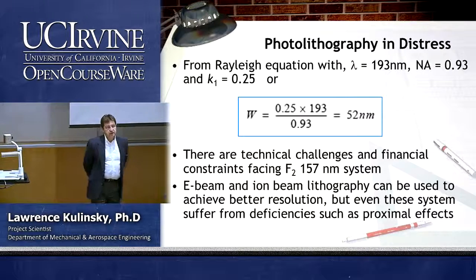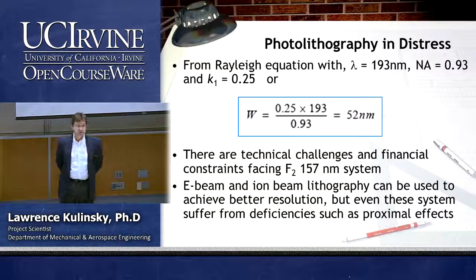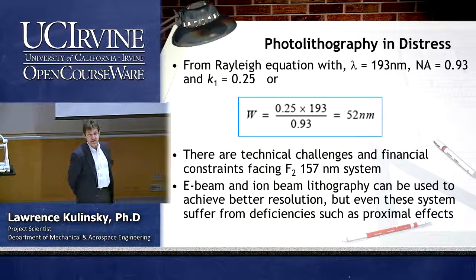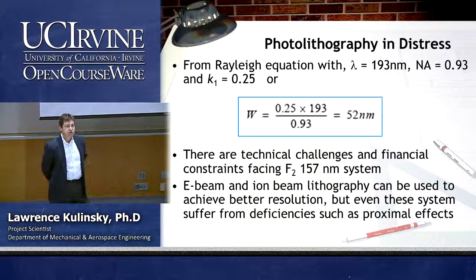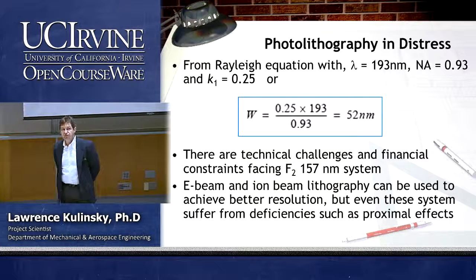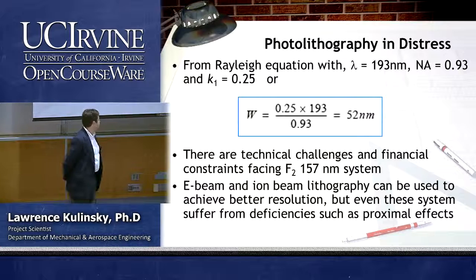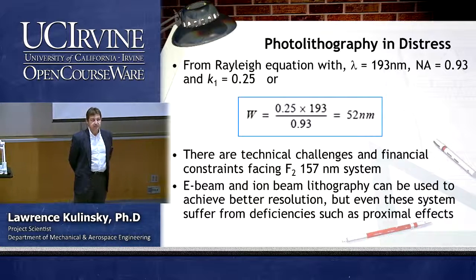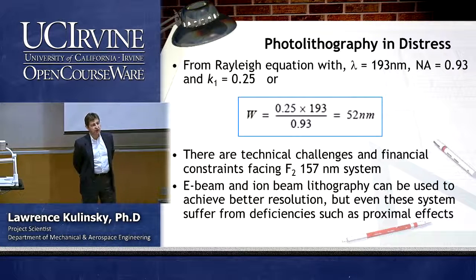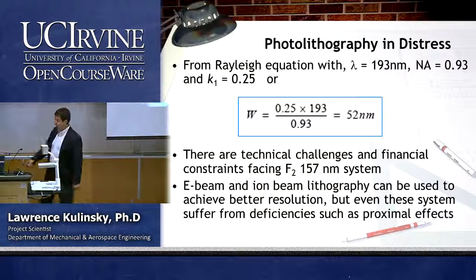As you know, the diffraction limit forbids resolving features that are smaller than the wavelength of the incident radiation that you use. For example, for conventional optical microscopy, we're talking about 200 nanometers. When you use even the most advanced argon light sources, we're talking about, at best, 50 nanometers. But the proximal probe techniques that we are going to discuss today allow us to go to atomic resolution and actually resolve individual atoms.